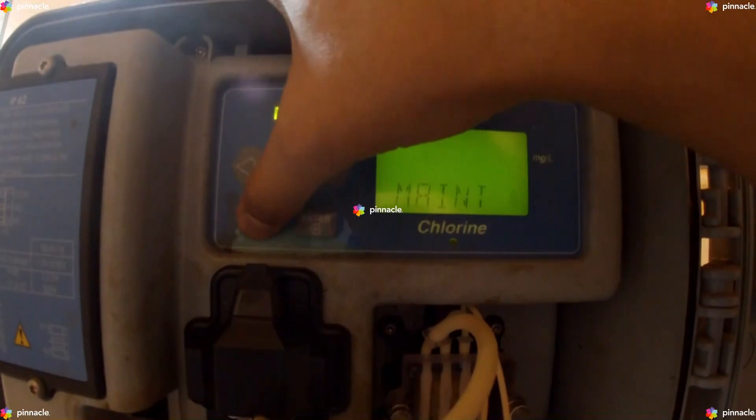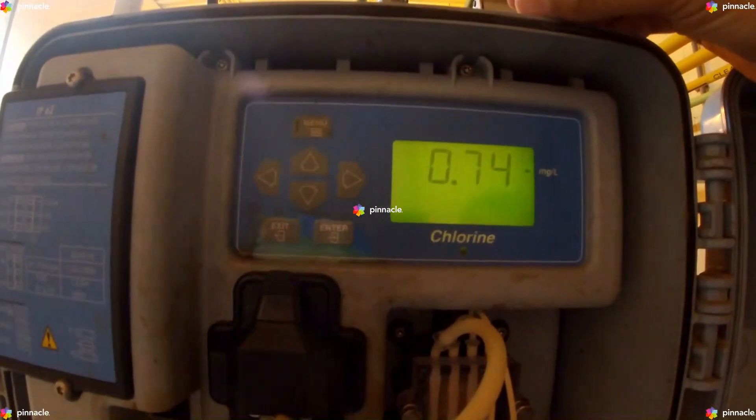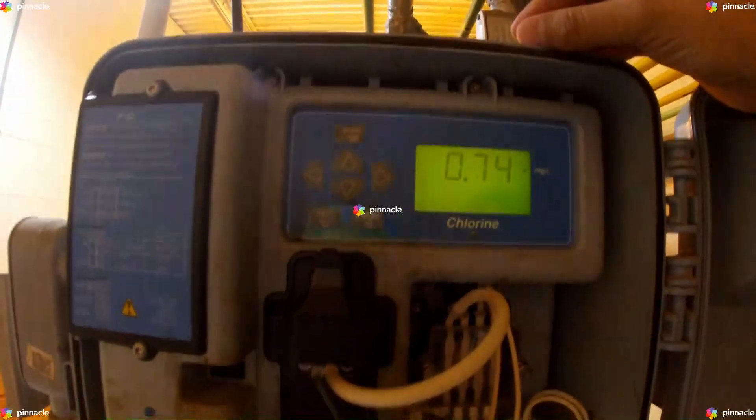This indicates that the hold output of the instrument has been disengaged and is no longer active.